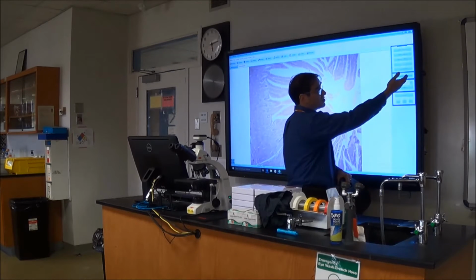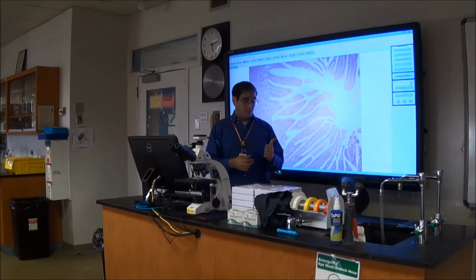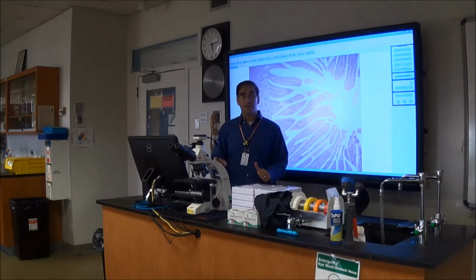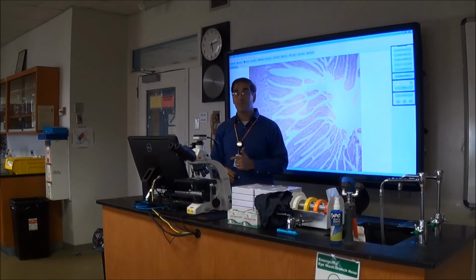And yet again, the teaching demo button reappears, so you can always switch back and forth. So, to recap, you can show all the students that are connected right now whatever one student has. If you find one student has something really interesting, you send that out to them. You have something really interesting here on your microscope, you can send that to them.